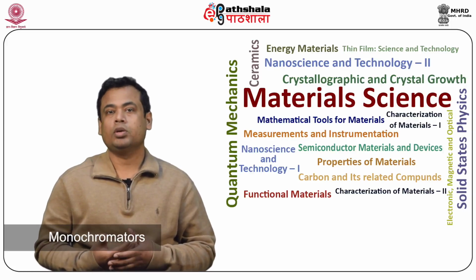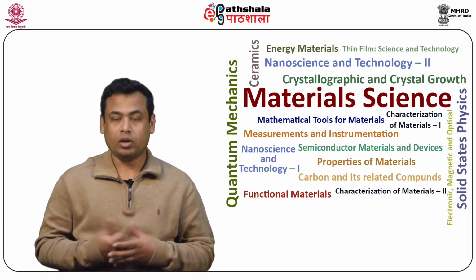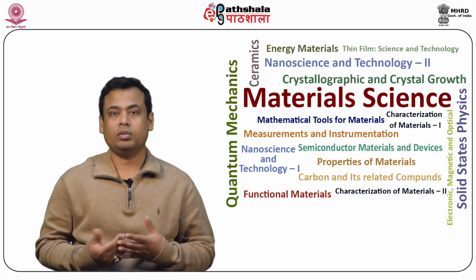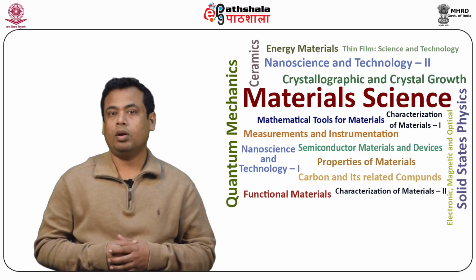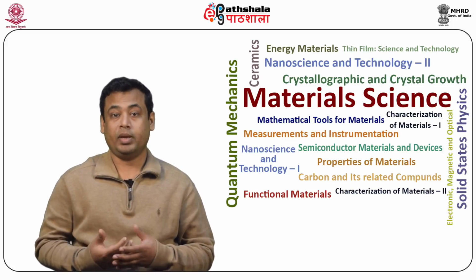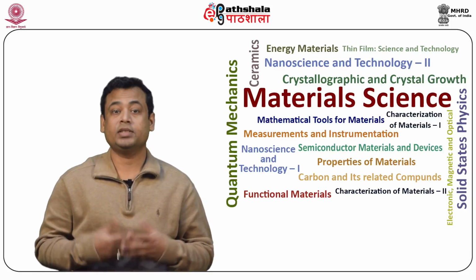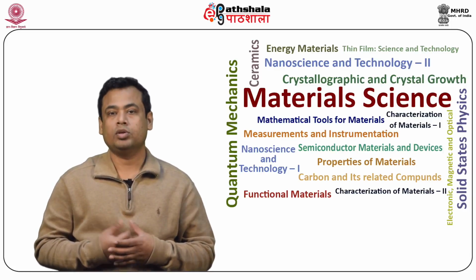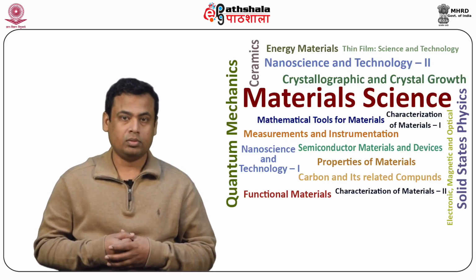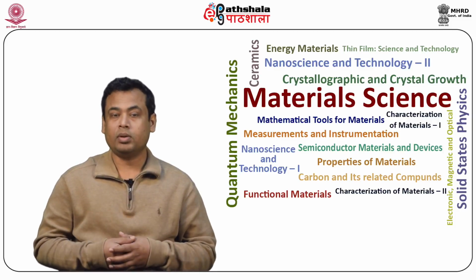Monochromators are used to disperse white light consisting of various colors or wavelength. This dispersion can be done with the help of prism or diffraction gratings. The diffraction grating makes light that enters the grating change the angle depending on the wavelength. This change makes it possible to get the necessary wavelength with the proper adjustment.